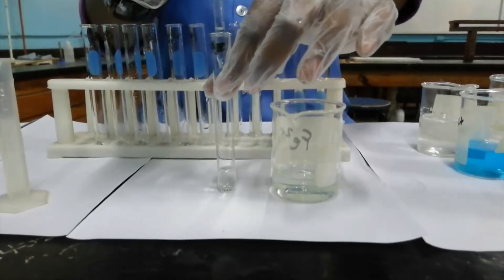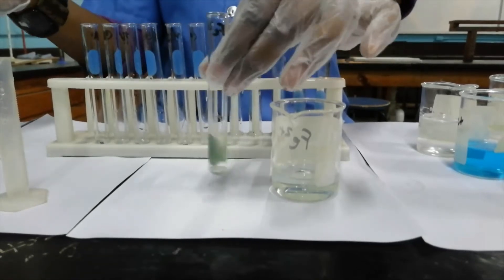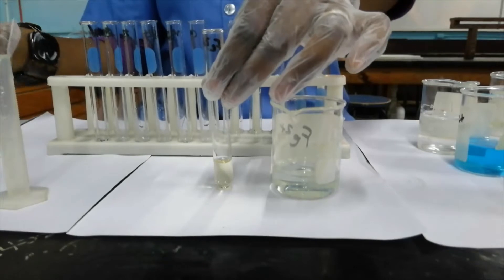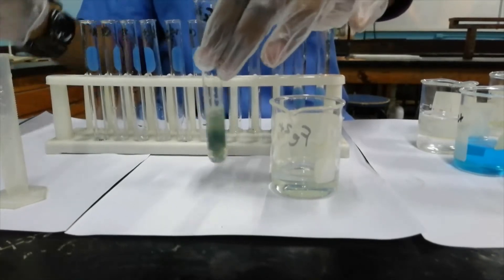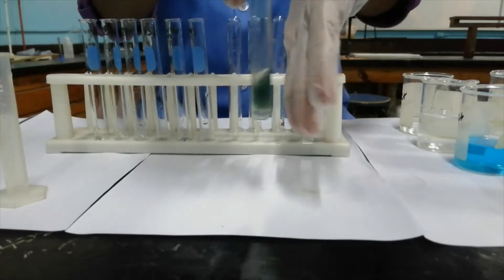I'm now going to add sodium hydroxide solution to it and mix it thoroughly. And we've seen the formation of an olive green precipitate.